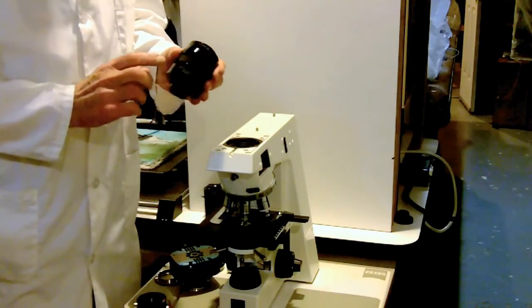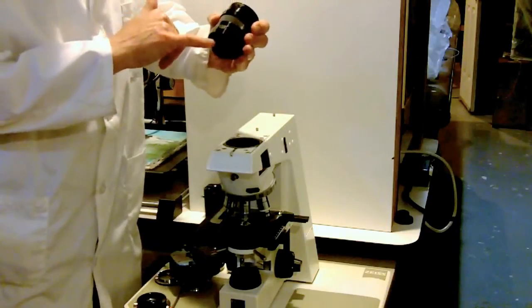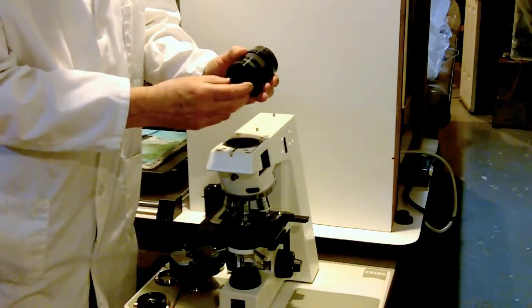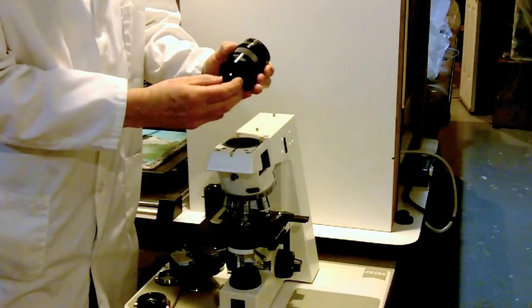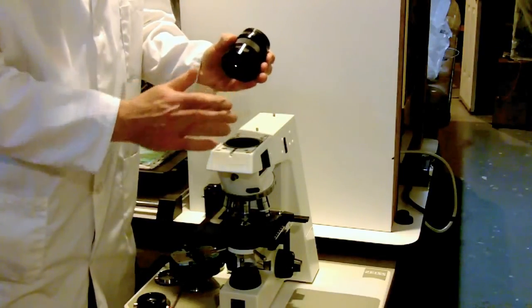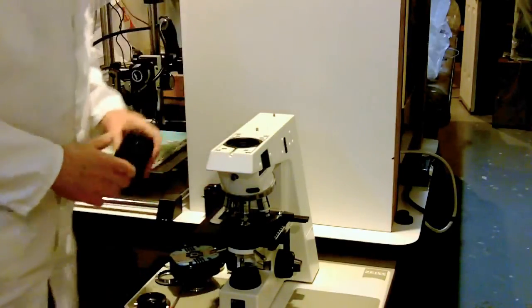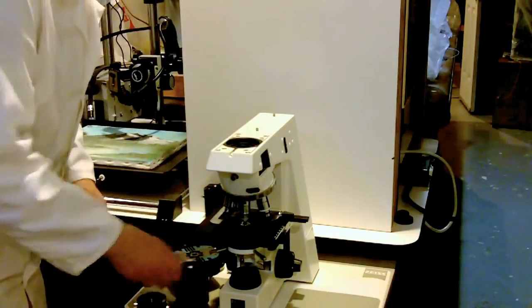Now the InFocus module has a special optical component here that attaches to the bottom. This is called the Z-type component. It's an optical lens set up just for the Zeiss ICS objectives.